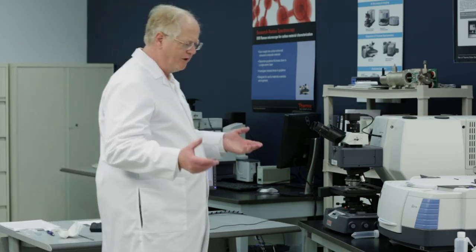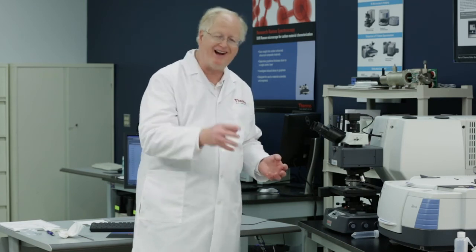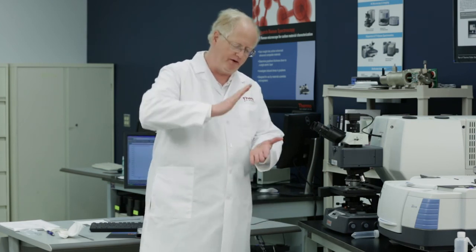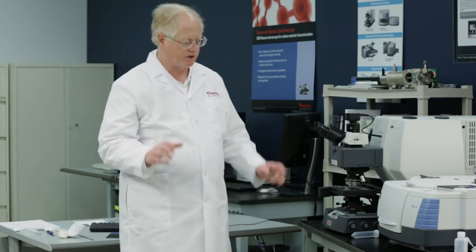So, very briefly and very quickly, that's why ATR is such a popular technique. It's so easy to use. I have run in the span of this video not only multiple different samples, but different kinds of samples. A solid piece of plastic, powder, liquids, run them all, no problem. This is why ATR is so popular. So once again, attenuated total reflectance, the important thing, being in contact with that surface, push down hard and be in good contact with the surface and you'll get a good signal. So attenuated total reflection, use it, it's a great tool.